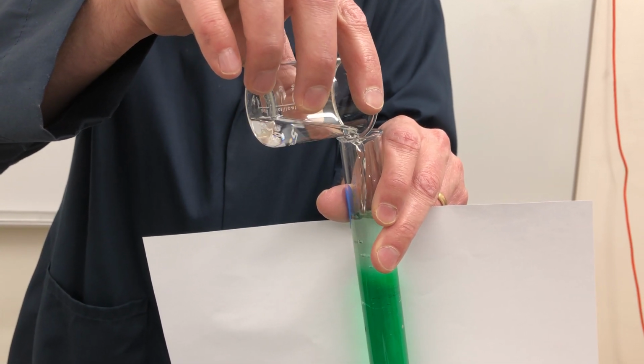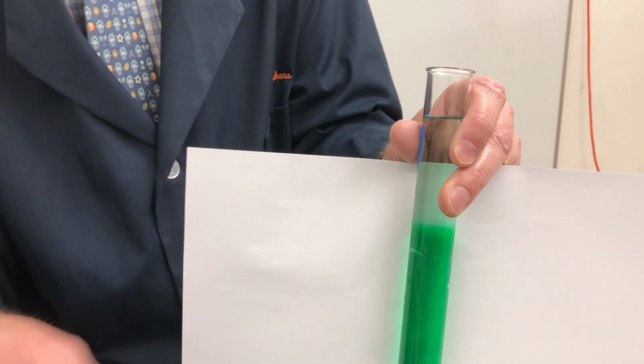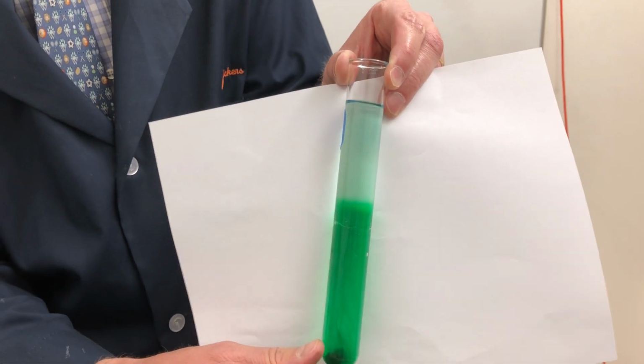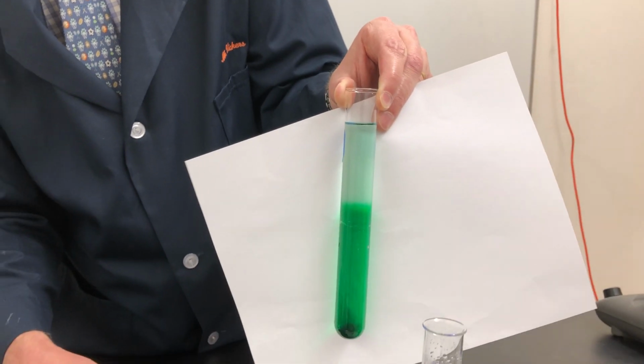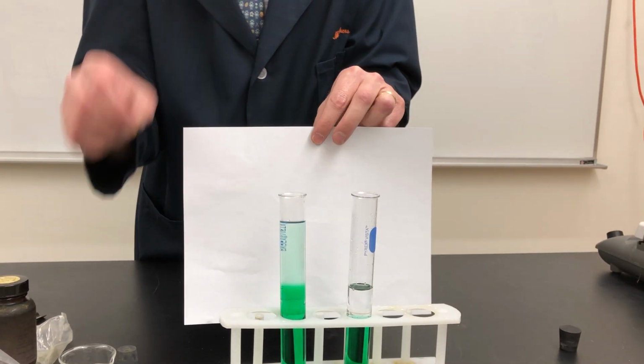And so you can see that the food coloring does mix in with ethyl alcohol. Ooh, that's more of that than I intended to pour. It mixes a little bit with the ethyl alcohol right at first, but we still got a layer of ethyl alcohol up on the top there. So how is that any different than the hexane then? Well, let me show you this.